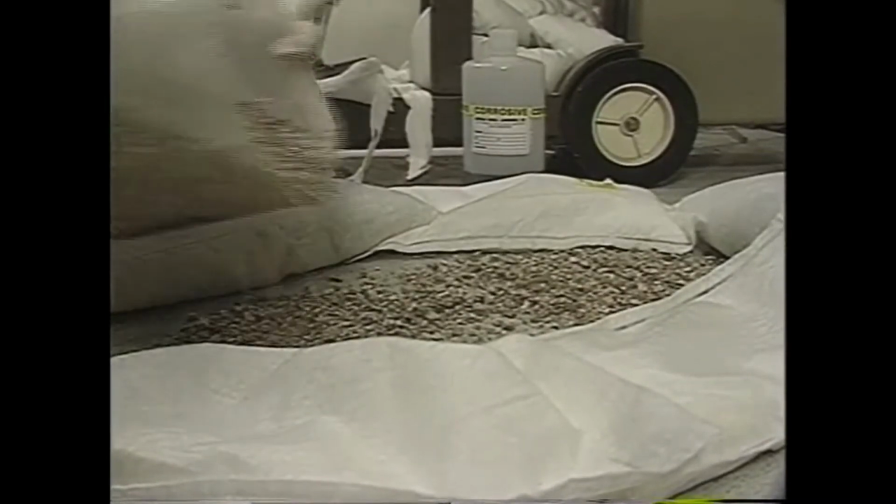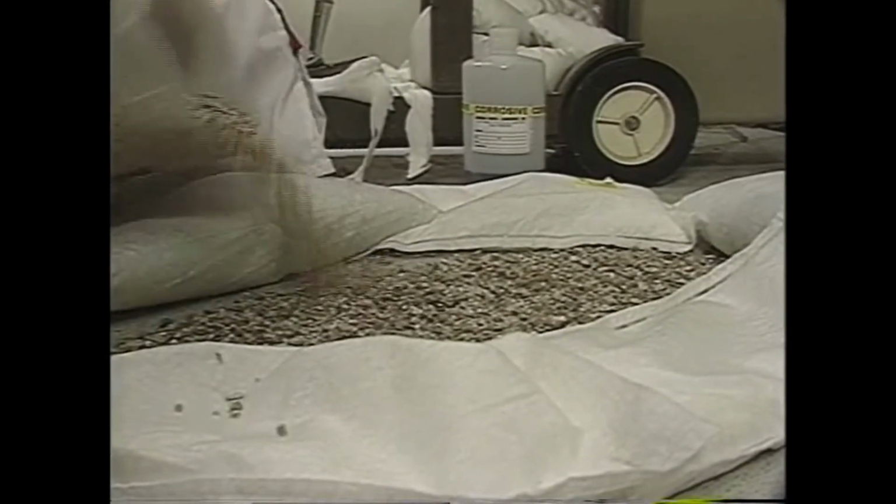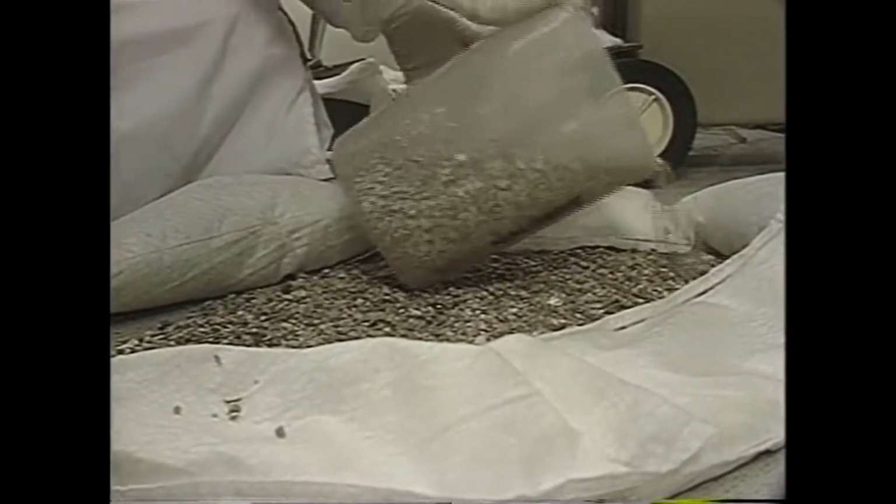But remember that not all chemicals should be handled the same way. Many chemicals can be absorbed with a non-reactive material, such as vermiculite or dry sand. However, inorganic acids and bases need to be absorbed with a neutralizing substance, such as soda ash. Check the MSDS for proper cleanup procedures.